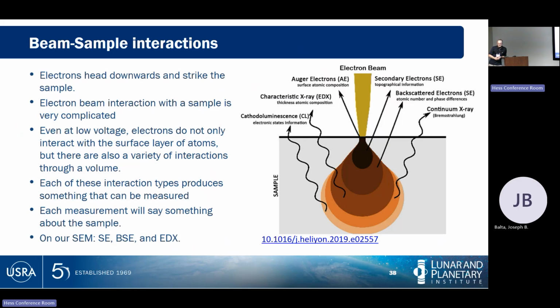You were upset at me last year because it made you take away the picture of saturating a tungsten filament. What was that? Yeah. I never did bother to explain to you that the reason I didn't like that slide was just because I thought it was a crummy slide showing how it really happens. When I envision it, I don't envision some wavy thing getting higher and higher. I really do envision a curve flattening out. And I'm not even sure what's on the X or Y axis of my vision, but it corresponds to what's happening when I'm turning the dial.